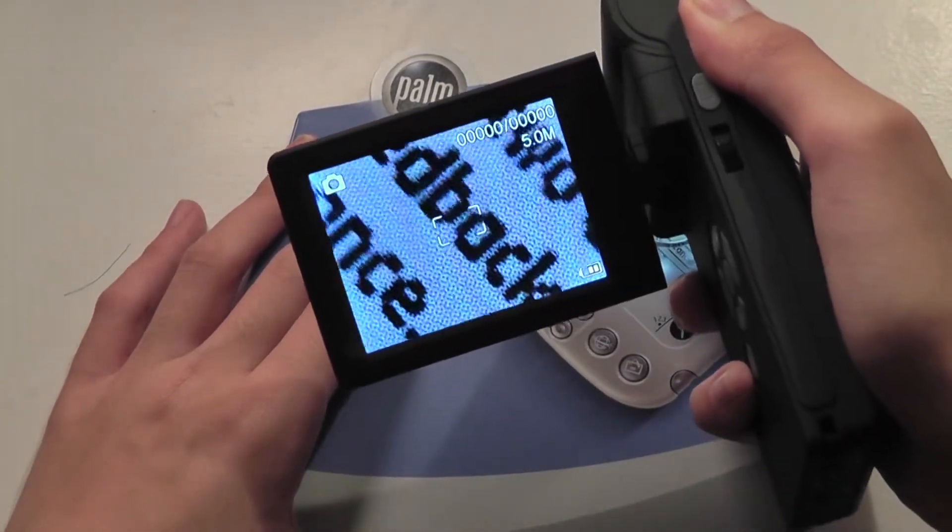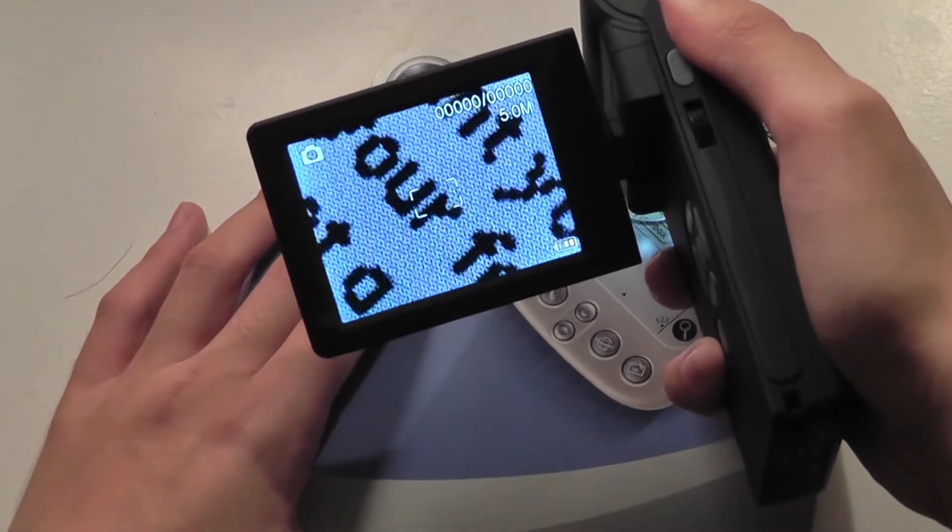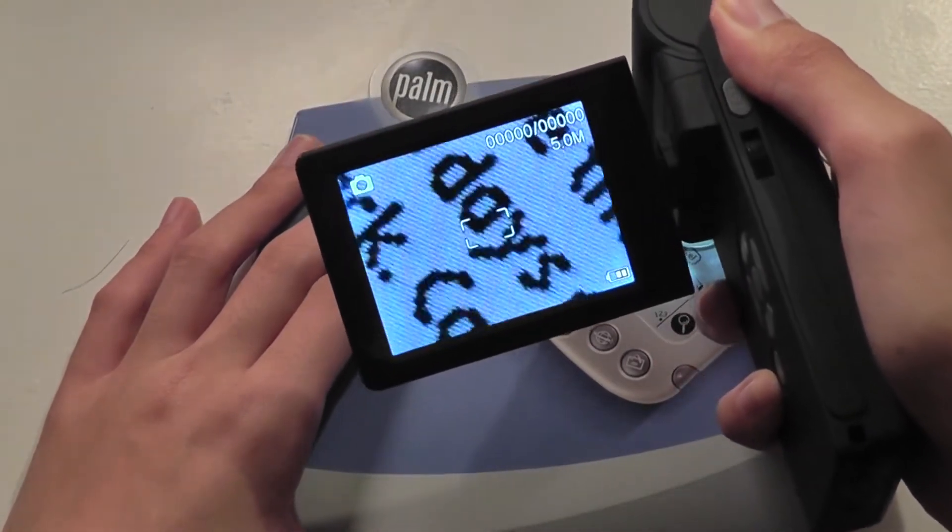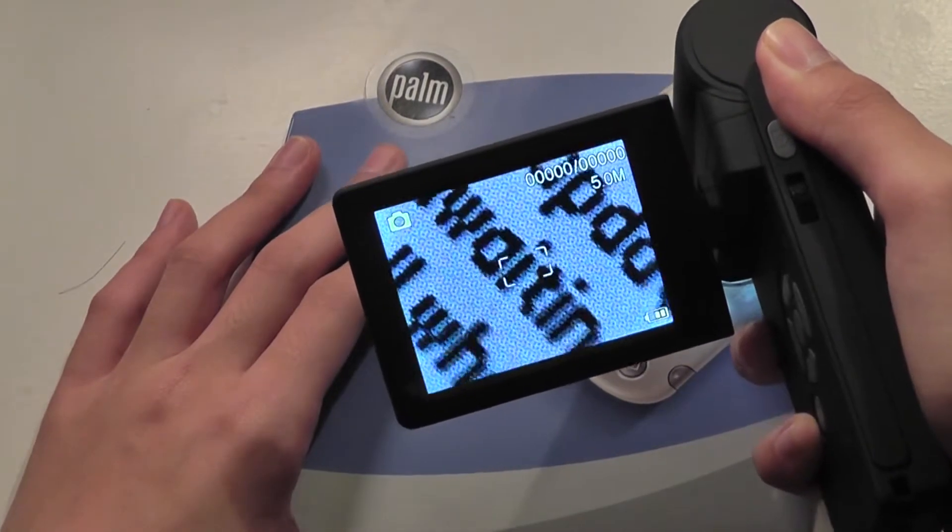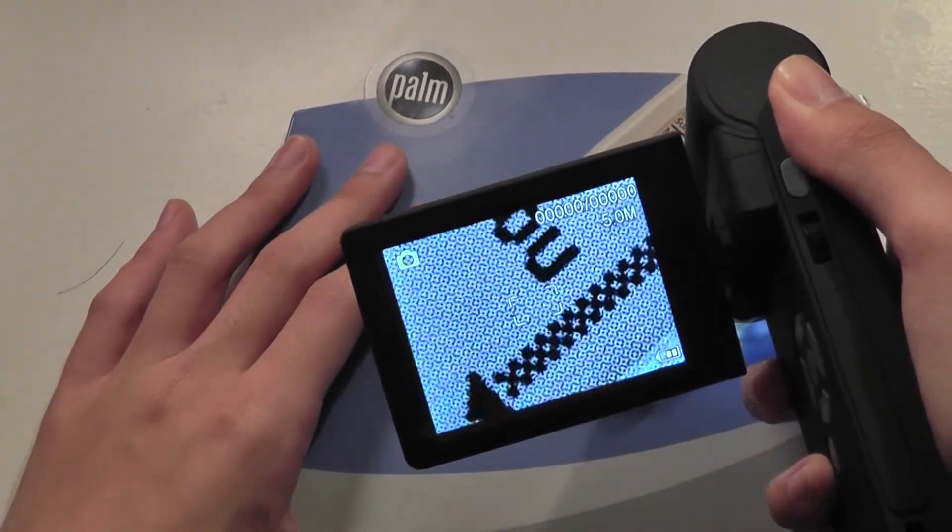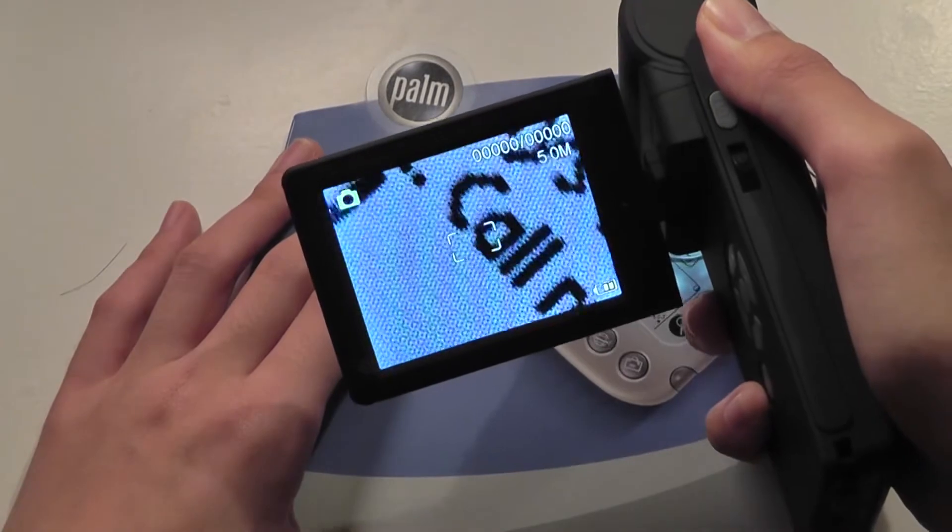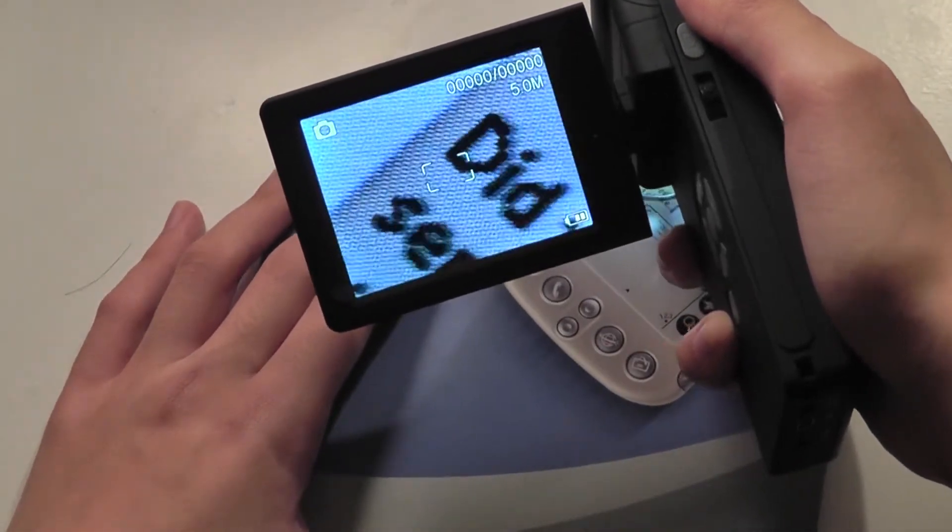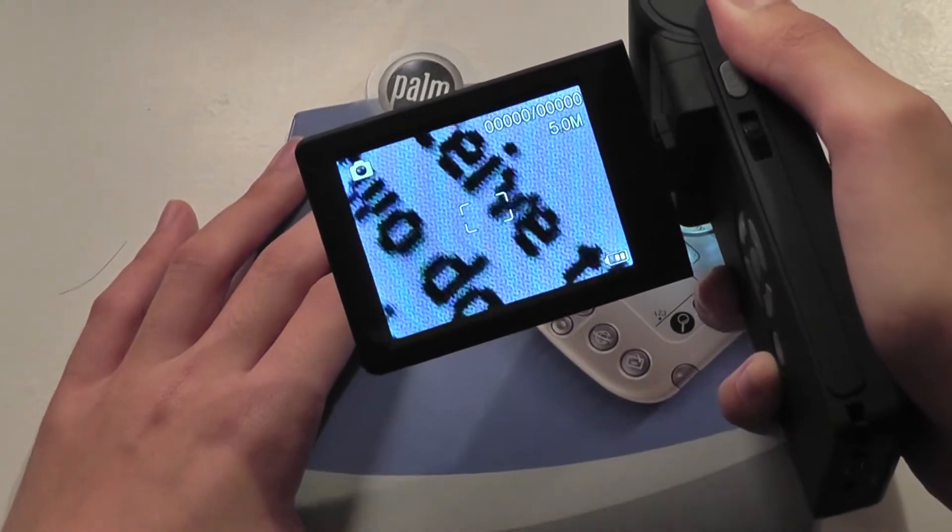You can get to a pretty far extent. Everything is pretty clear, it's crisp. You can actually record it and take an image of it. The weakest link of this particular device is going to be the video capturing, just because the frame rate isn't that great, and it's also not HD quality, and there's a bit more stuttering and slowdown. But as far as image quality is concerned, it does work very well.